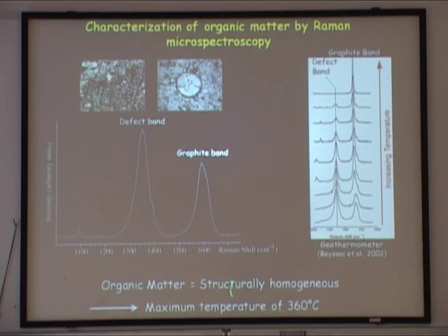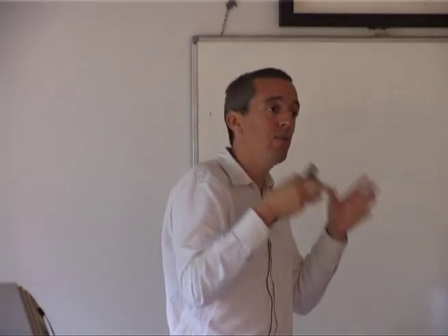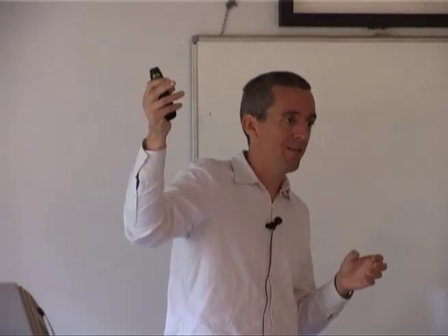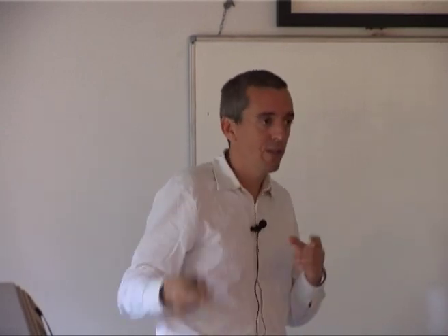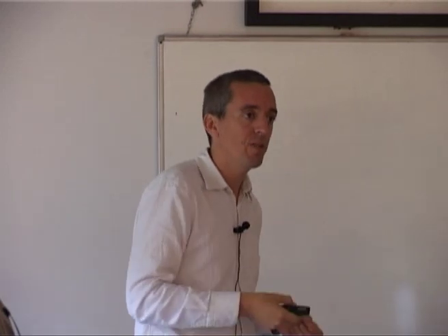From this spectrum, we could see that the maximum temperature experienced by these objects was 360 degrees. So that means that these objects are not just contaminants that were trapped into the rocks after the metamorphism, they really experienced the metamorphism.